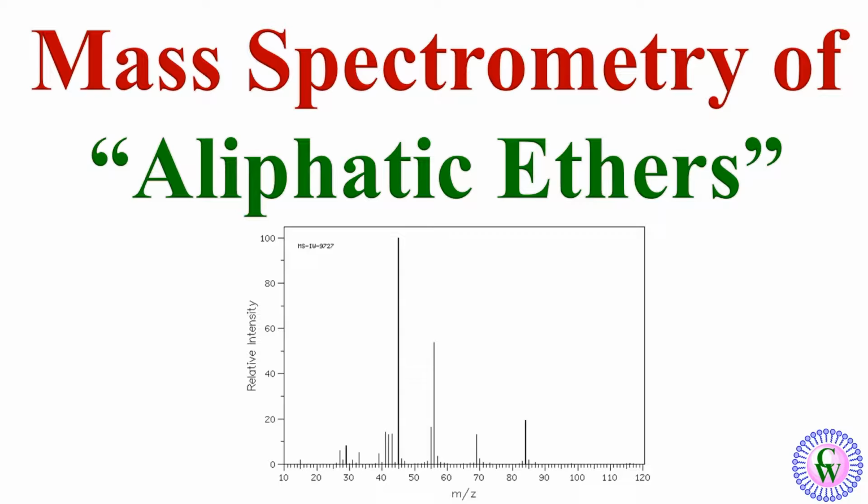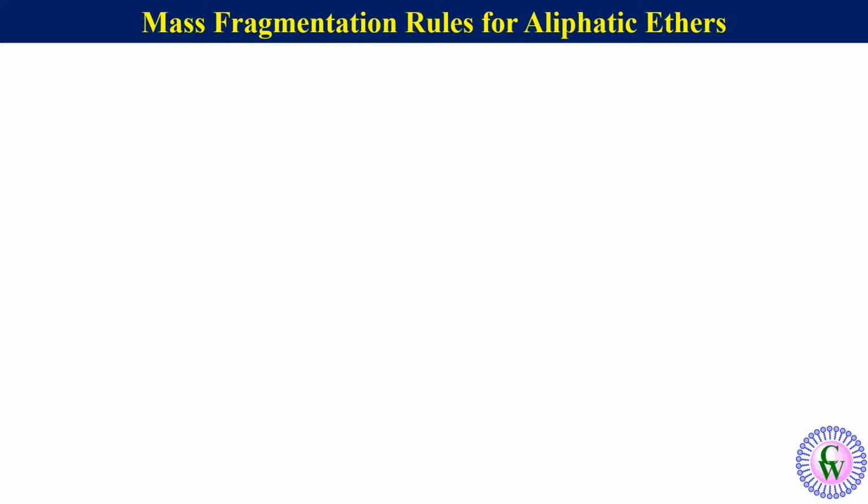In this video we are going to learn mass spectrometry of aliphatic ethers. We will learn how this technique provides unique insights into their molecular weight, fragmentation pattern and structures. We will first go through basic fragmentation rules for aliphatic ethers.